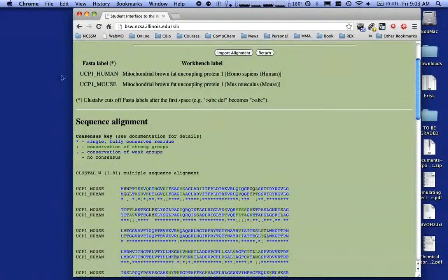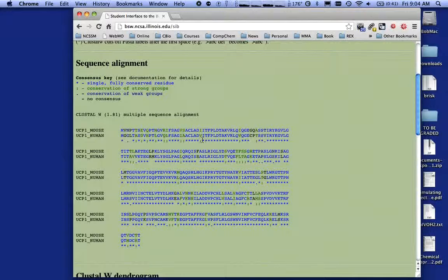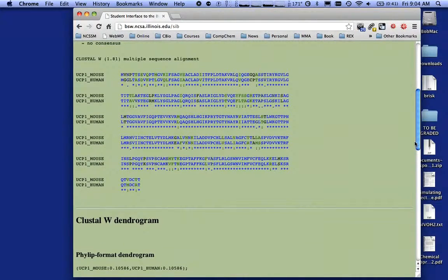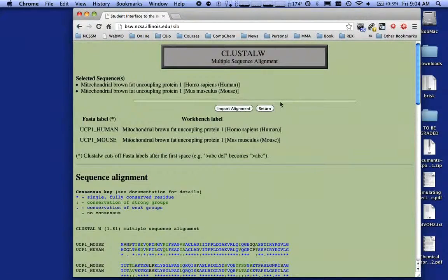If I scroll down, I've aligned human and mouse. Anything in blue means they're exactly the same. Anything in green means they are similar but not exactly the same. You'll see some light blues — that means there are some differences in amino acids. The ones in black mean there's no consensus, either completely different or unknown. Most of the time no consensus means they're completely different — for example, P and M are not even close to being the same.